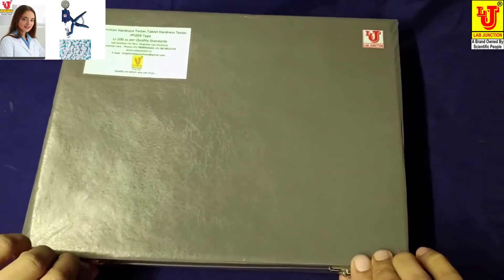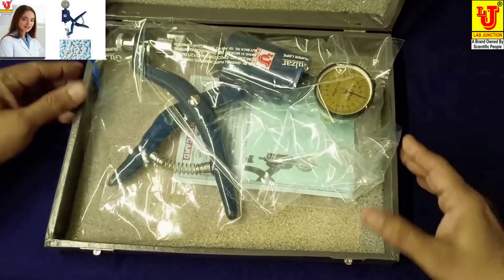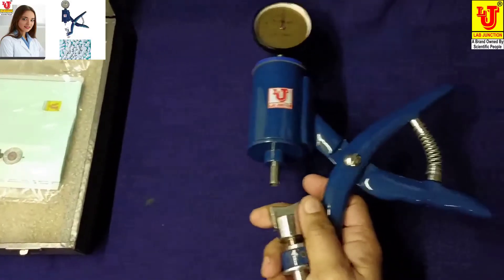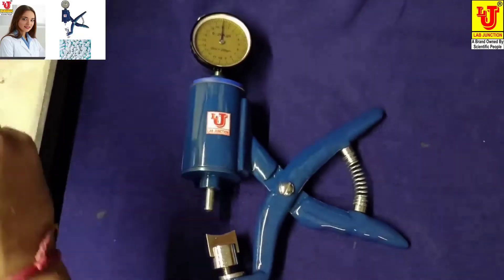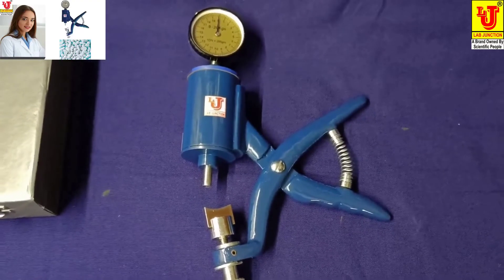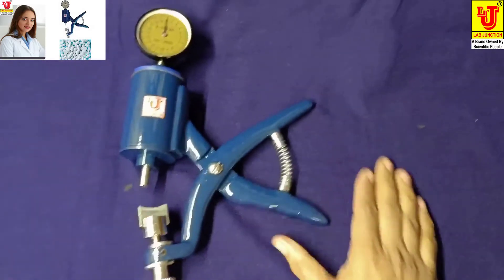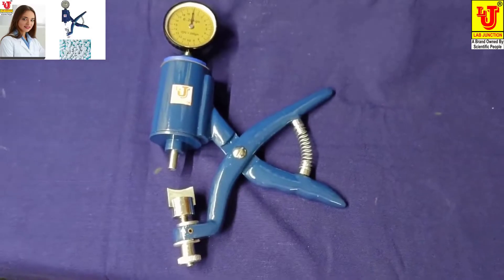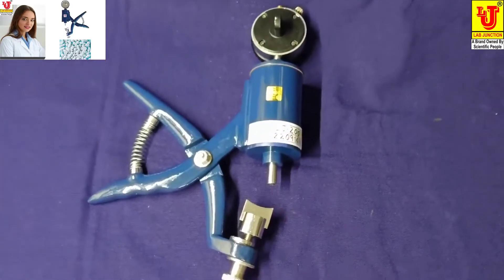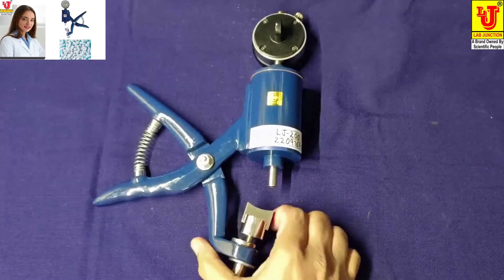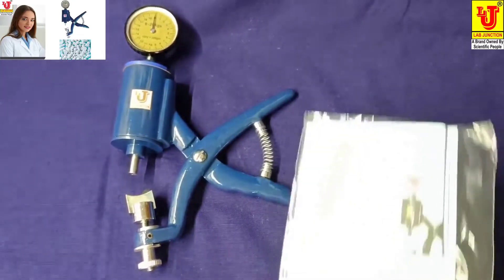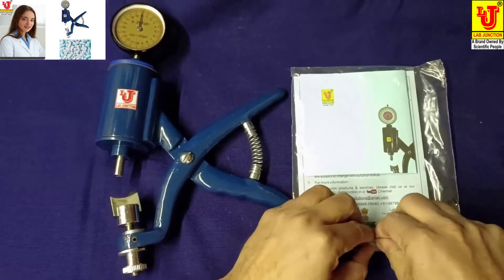Now I am unboxing this. This is our main instrument with the instruction manual.